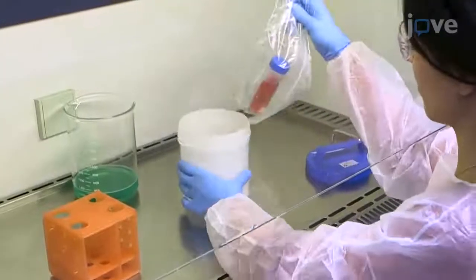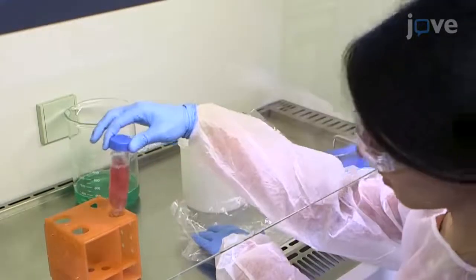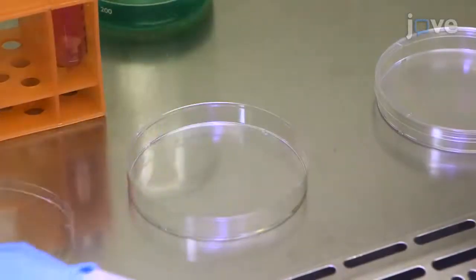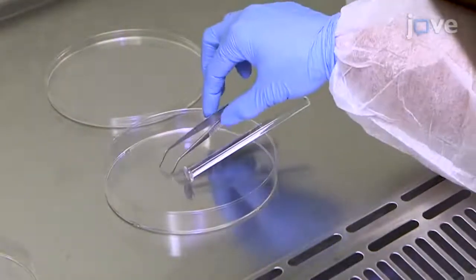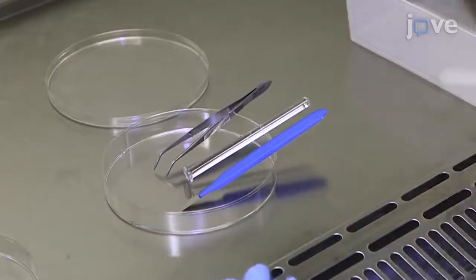Transport the human tonsillar tissue to the laboratory as described in the manuscript text. Next, place a cell strainer onto a 150 by 25 mm culture dish. Place all the dissection instruments in another dish to keep them sterile. All human specimens should be handled with care as they have not been previously qualified and may contain infectious agents.